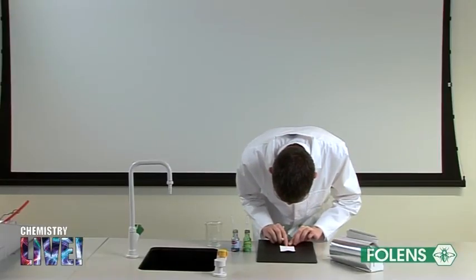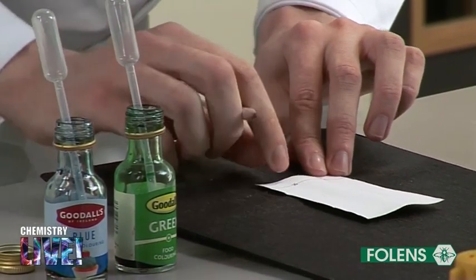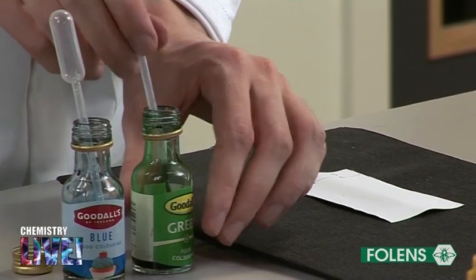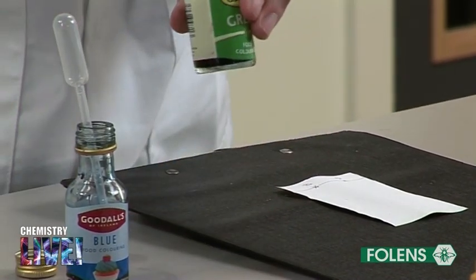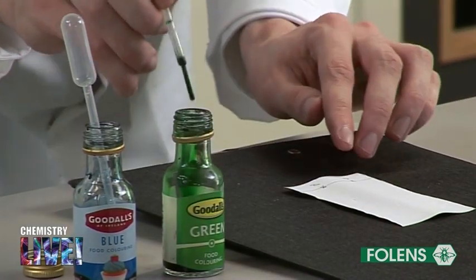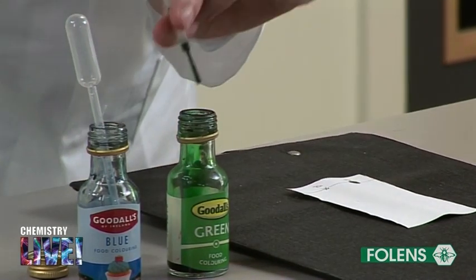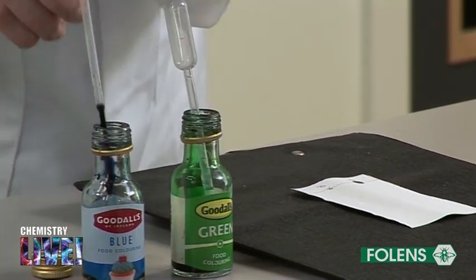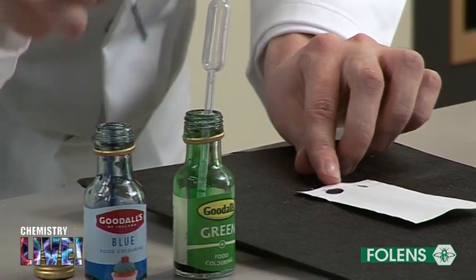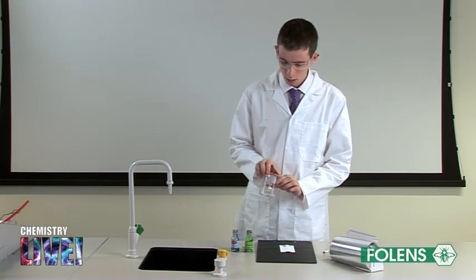Using the pencil, identify each food dye. With the aid of a dropper, place a small spot of food dye on the pencil line. Water was poured into a beaker to a depth of about 0.5 centimeters.